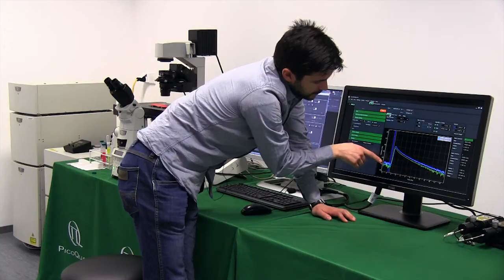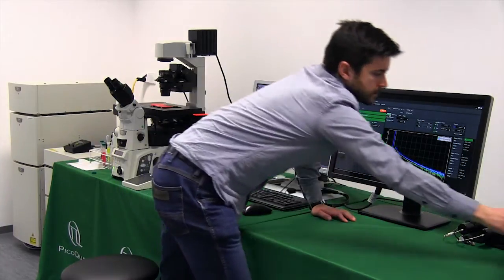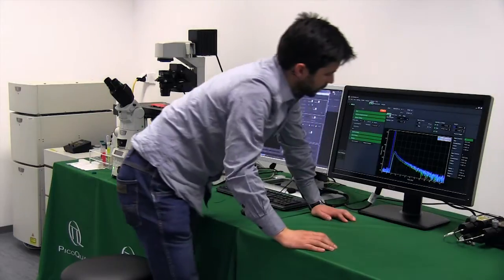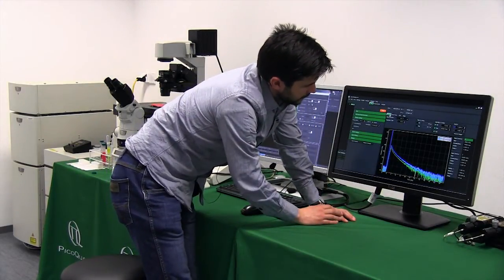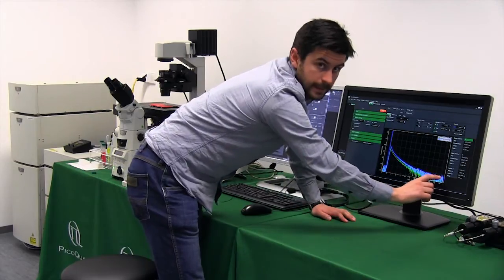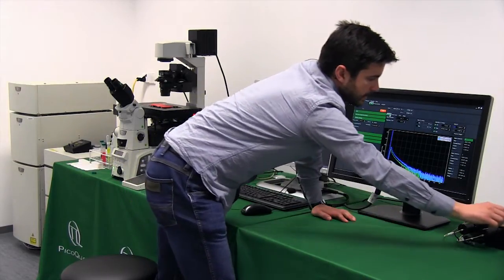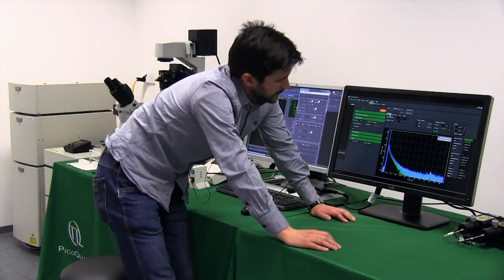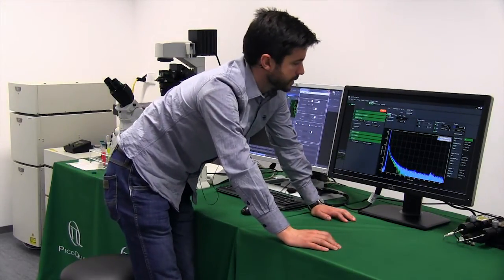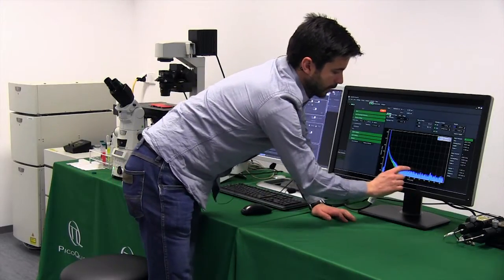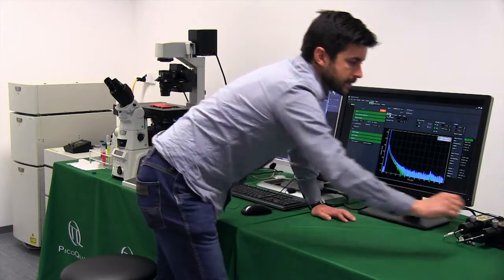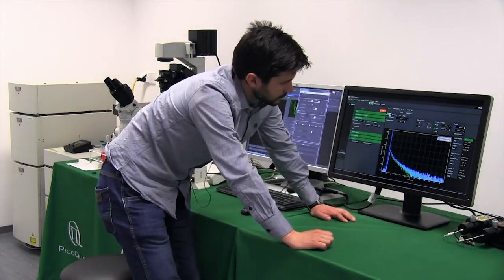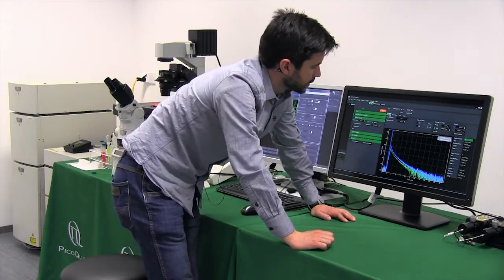For this given sample we've got here a flat line, the background is matching here and here. This repetition rate 20 megahertz could be just too slow because we have all these channels which are not using. So we want to optimize this and we keep it in this case at 40 megahertz.